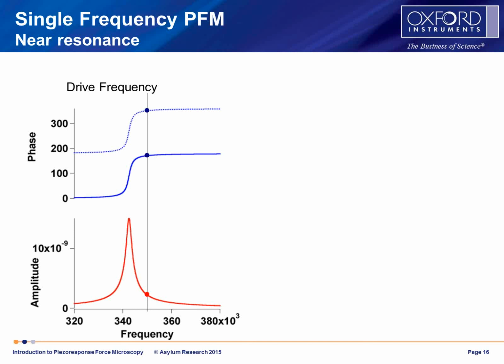So let's look at operation near resonance a little more closely. These curves here show idealized, calculated curves where we have the amplitude and then the phase. Now I've divided the phase up into two separate curves. This one is for, let's call it, an up domain, and if the polarization reverses, we get a 180-degree phase shift, so that whole curve gets put up by 180 degrees.